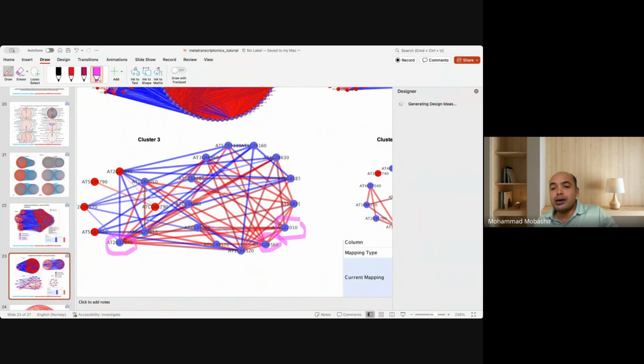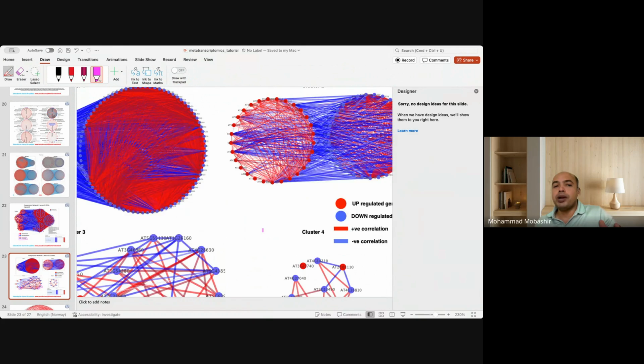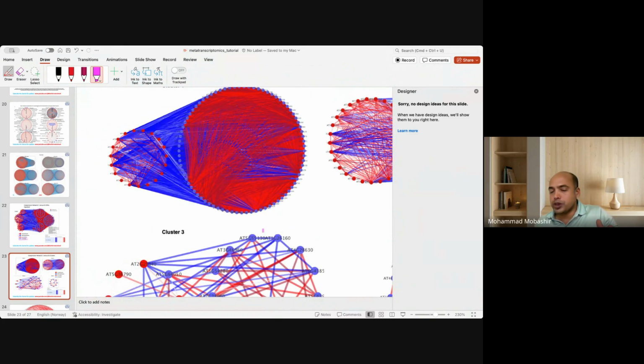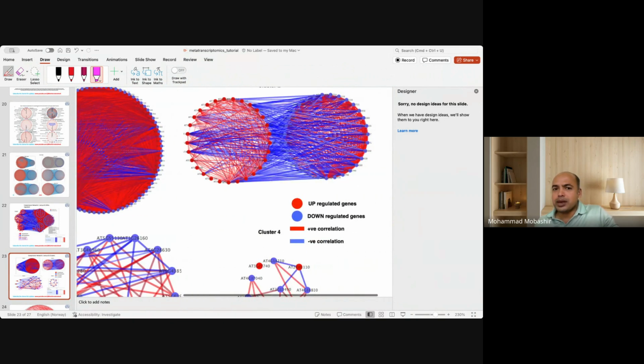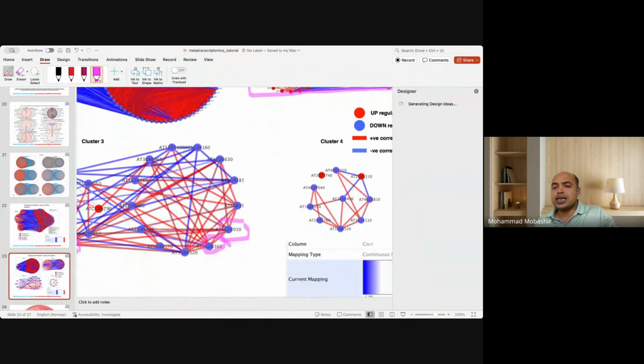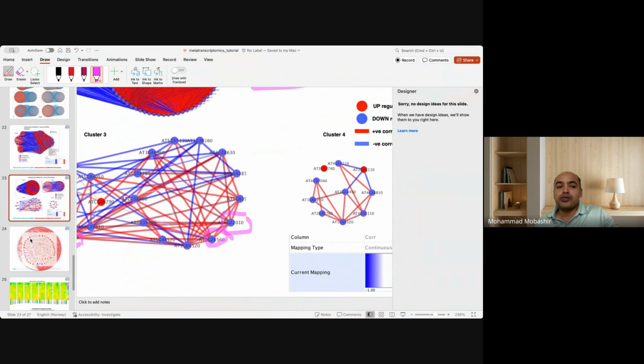So you can learn from this video how to screen out a minimal number of genes with higher significance from the complex network of the co-expressed genes or in any kind of gene networks. And these are complex networks, which is not that much clear to understand. So you can try to screen the network based on the correlation values or some other parameters which you could be interested in for your project.